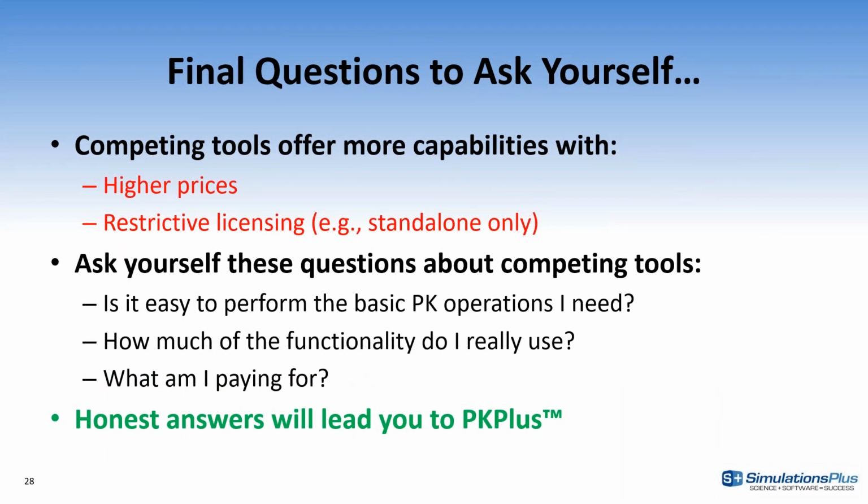What are you using as your current tool? What are the prices associated with that? We're fairly confident that we've created an out-of-the-box software that is going to be cost effective, is going to be able to still use a floating license to allow for some flexibility within your folks that may not be an everyday user for NCA and your compartmental analysis, but still have the opportunity to pop in and do the data visualization and be able to very quickly generate reports that are going to be able to go off into your different team meetings.